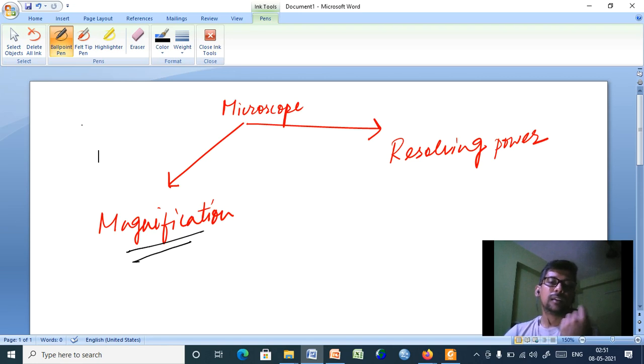Like this is the original portion of a small algae, usually found as a phytoplankton, Cosmarium.